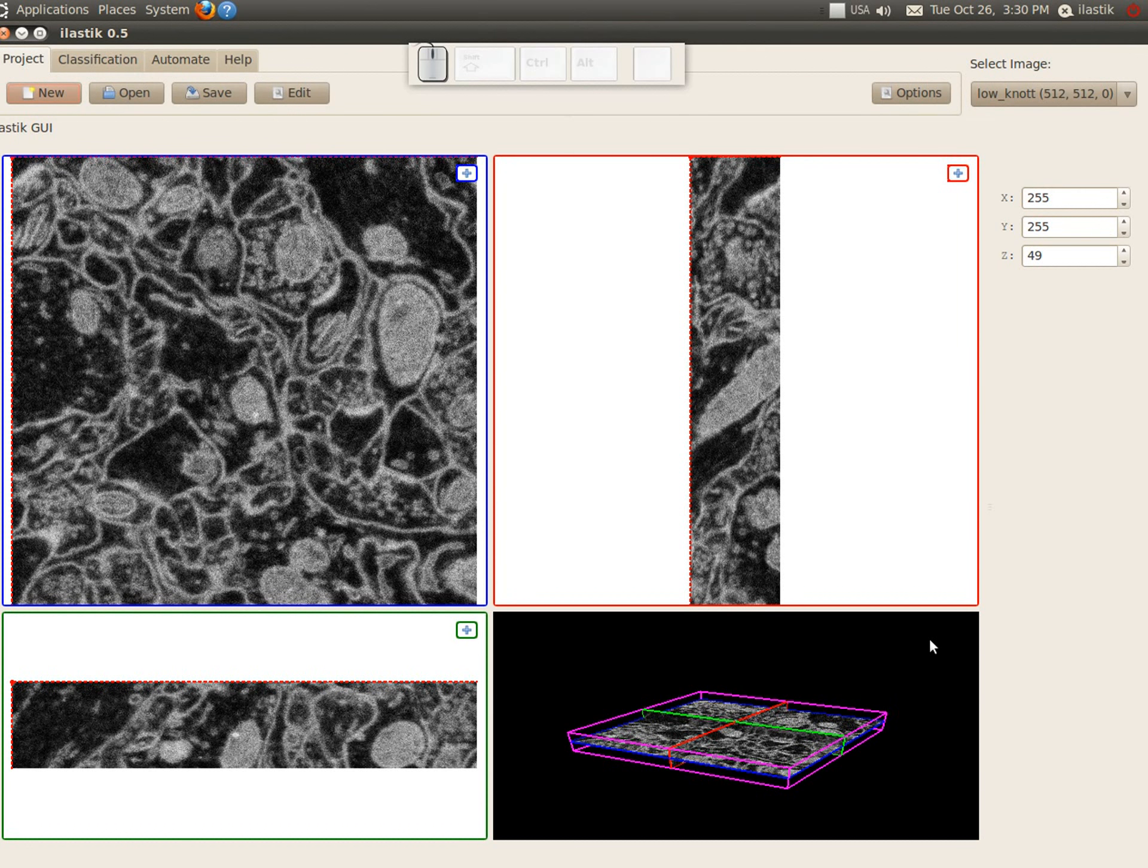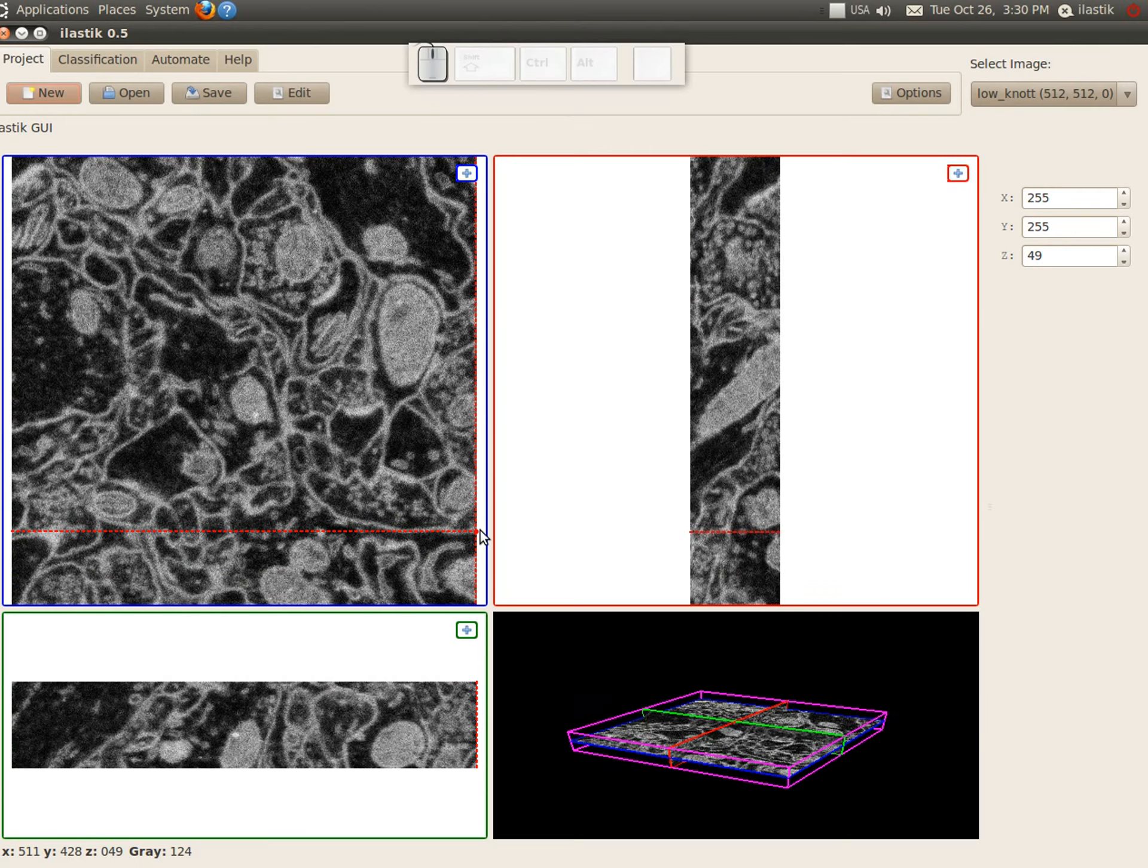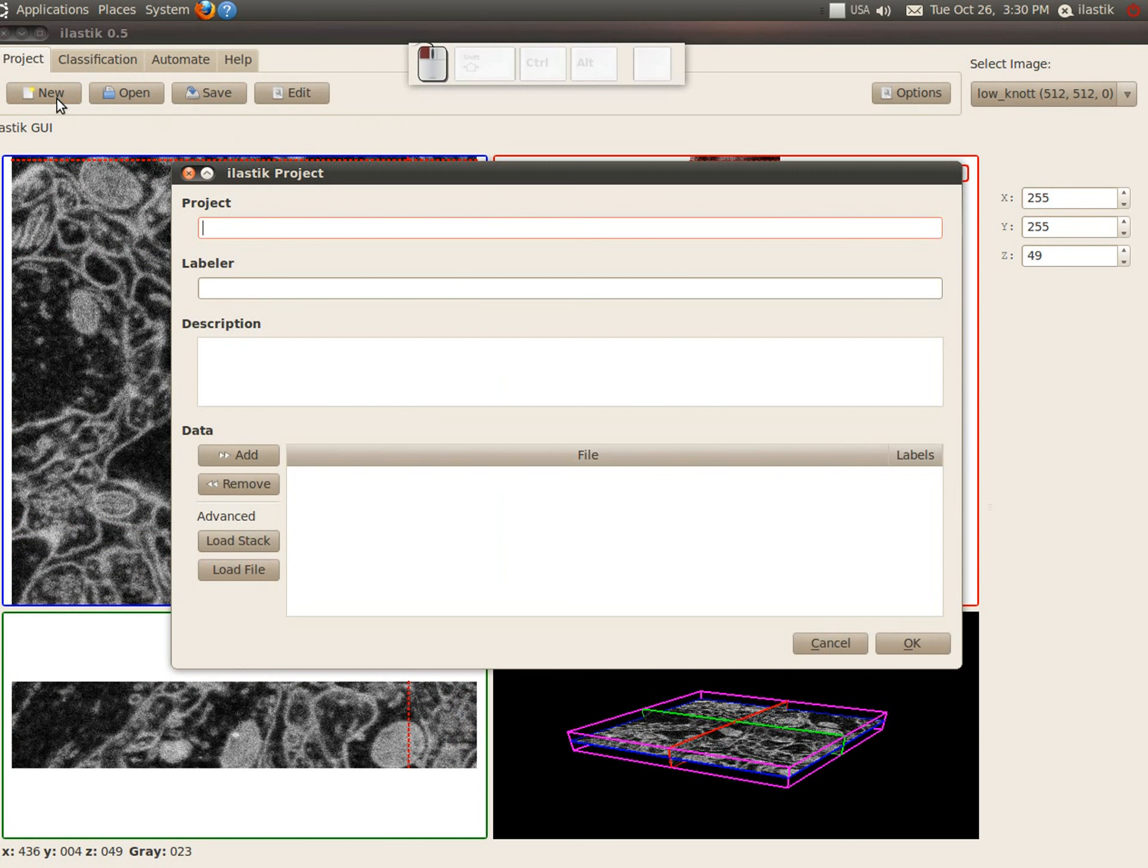You can see that the image is indeed displayed, but maybe it would be better if we inverted the colors. So let's explore some of the options that are provided in the load stack dialog.